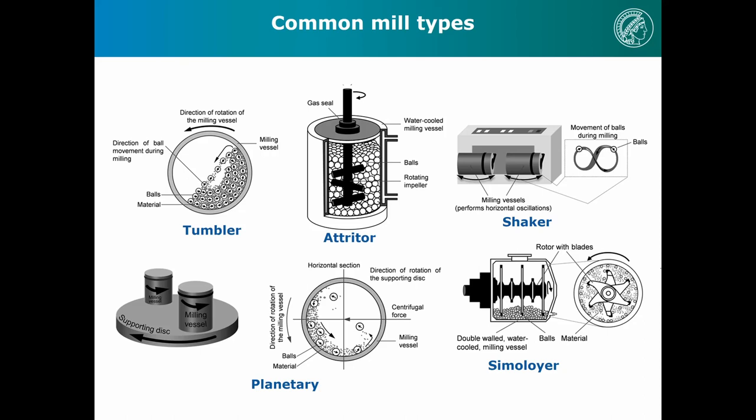And on the thing, there are little chairs or capsules which rotate counterclockwise. You have the big plate rotating this direction, the little chairs rotate the other direction. If you have ever ridden one of those things, you know you're really tossed around. And these things still happen in these planetary mills. So we have a support, and on it the milling vessel filled with the grinding media.